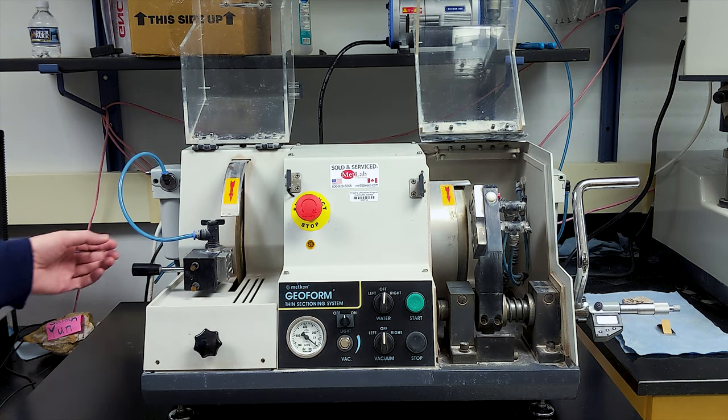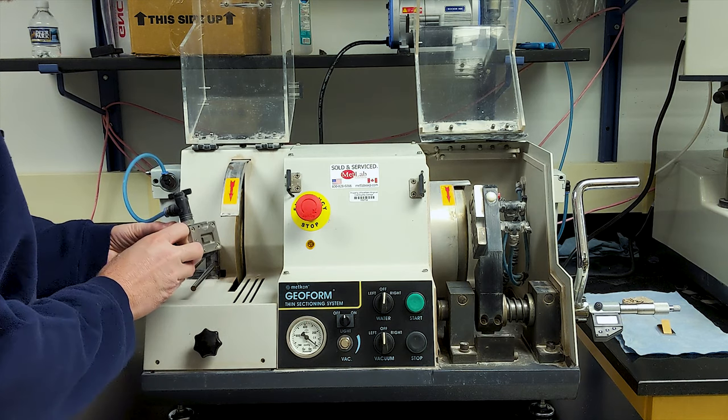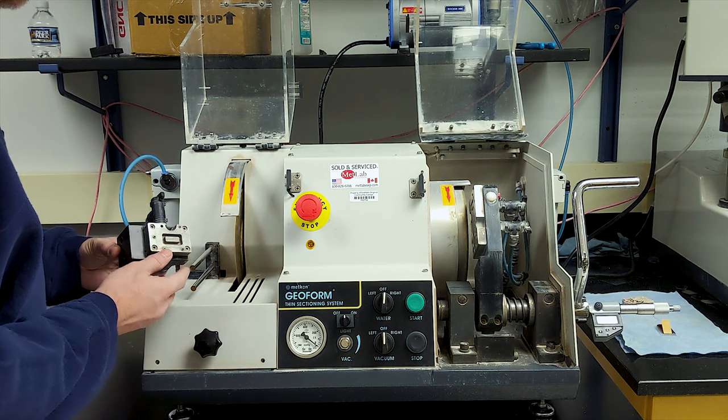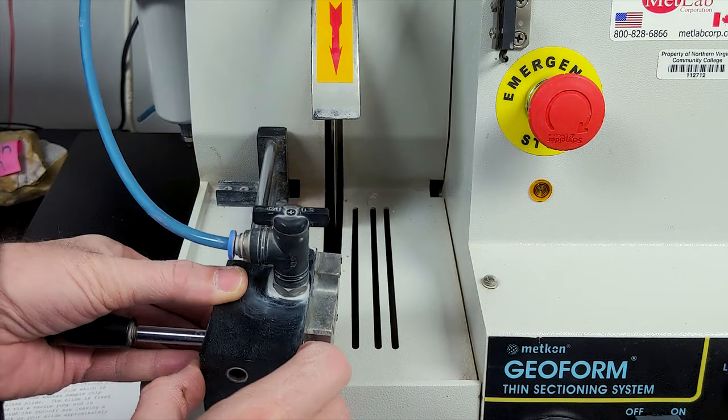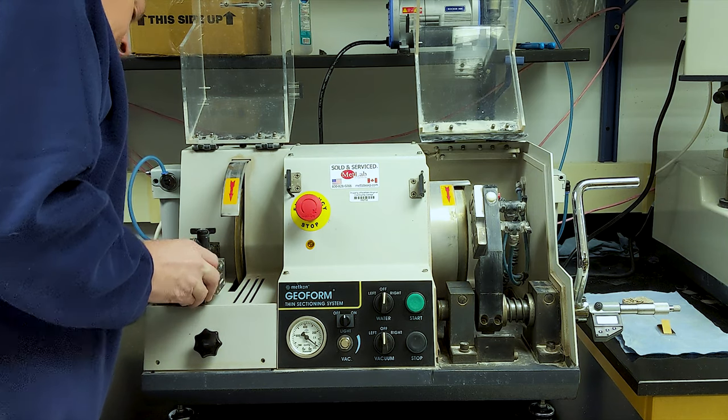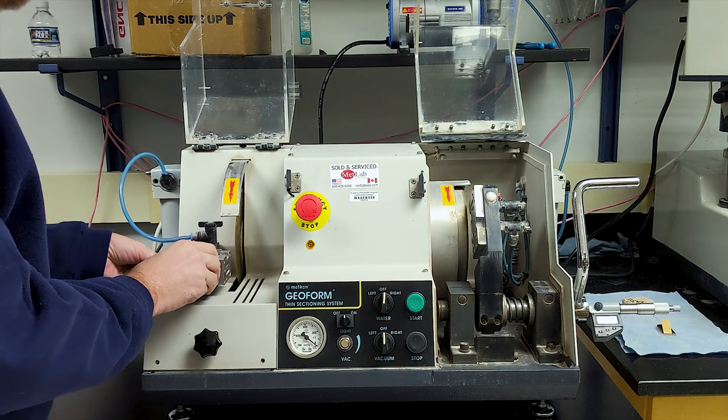The GeoForm has two primary functions. On the left is the cutting module, which is used to cut off the excess sample chip from the glass slide. The slide is fixed on a holder via a vacuum pump and is pushed through the cutoff saw, leaving a layer of rock on your slide approximately two millimeters thick.